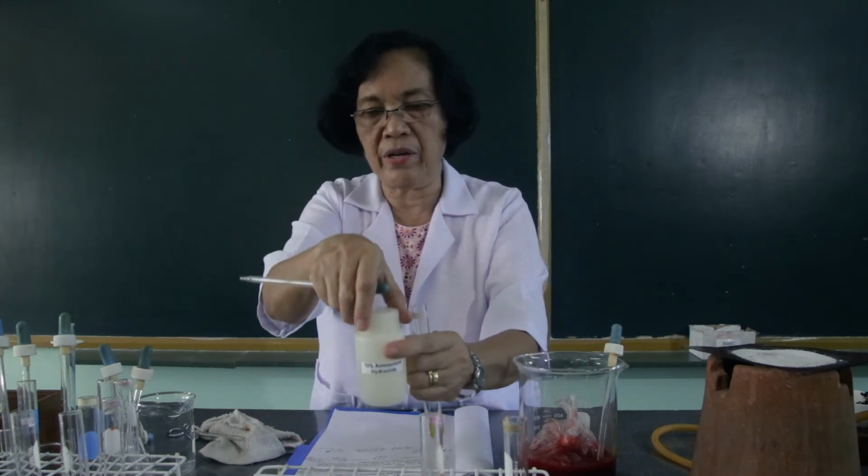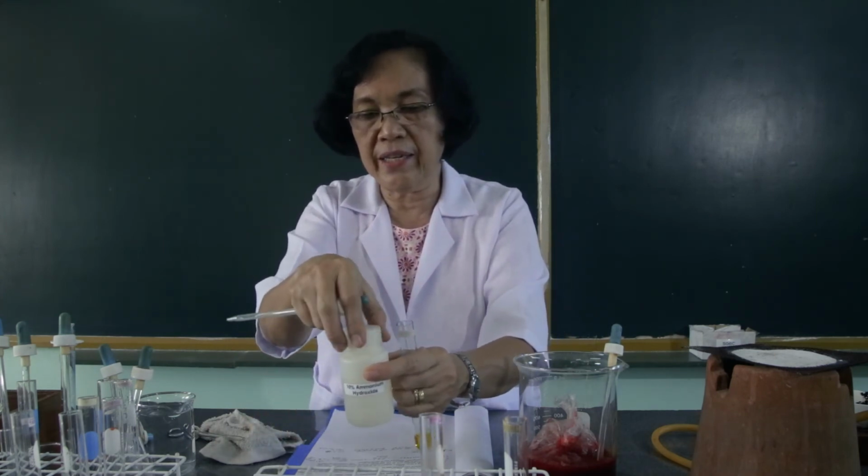Then I'm going to add to the Stokes reagent ammonium hydroxide until the precipitate that is formed will be dissolved.